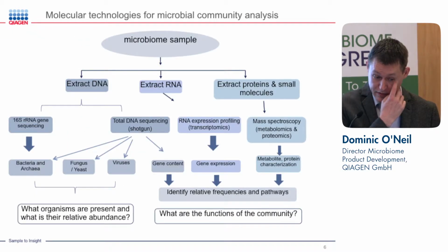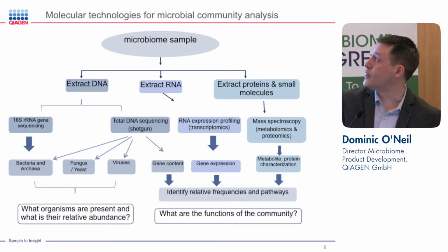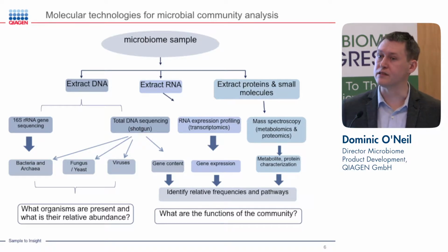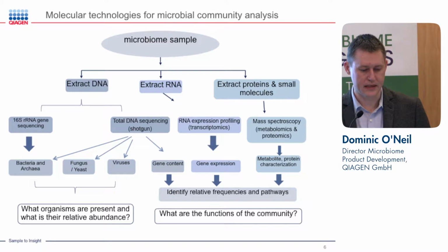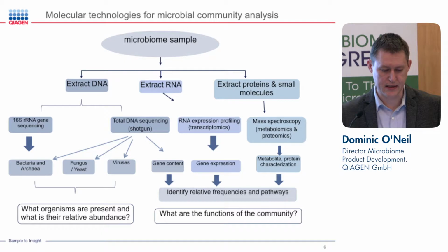And here's a brief introduction to microbiome samples and microbiome technologies. So everything really does start with the sample. If you have a microbiome sample and you're not able to extract the analyte of interest from it, you're not going to get good data to be able to find any new insights. And for things like gut samples, it's particularly difficult to extract DNA, RNA. I'll go into that in the next couple of slides on IRT.